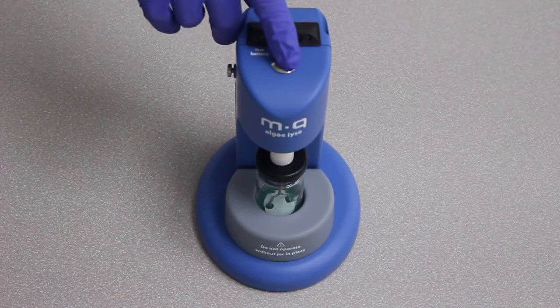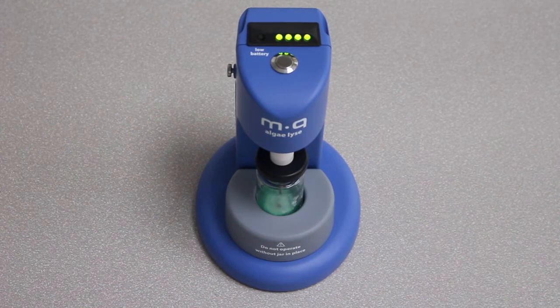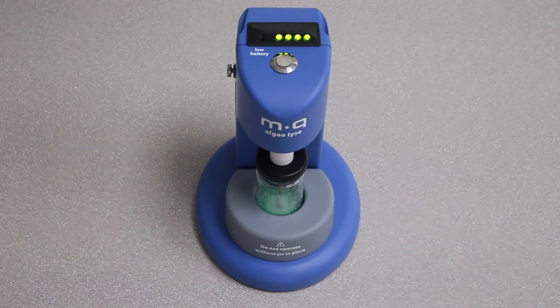If your sample requires lysis prior to running, please do this by performing a 3 times freeze-thaw method or by using MBio's MQ Algalyse device.